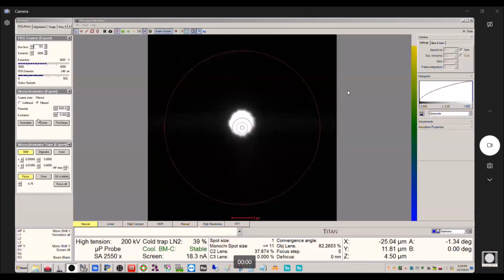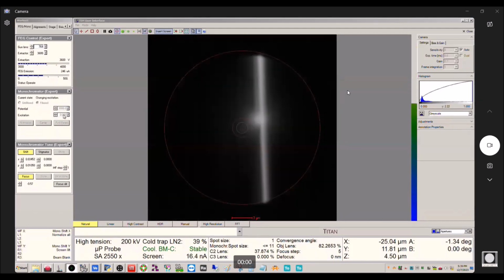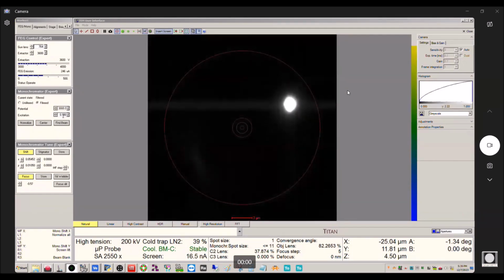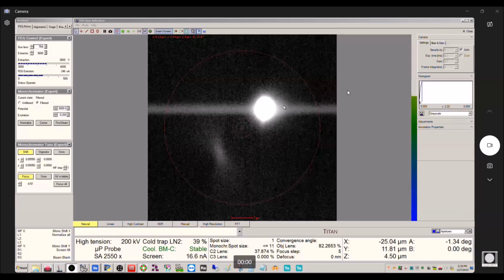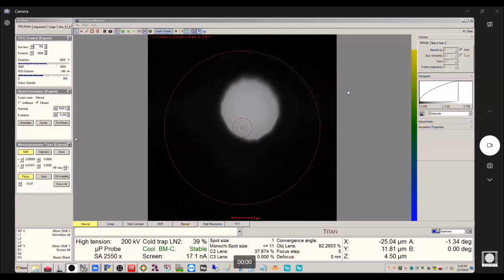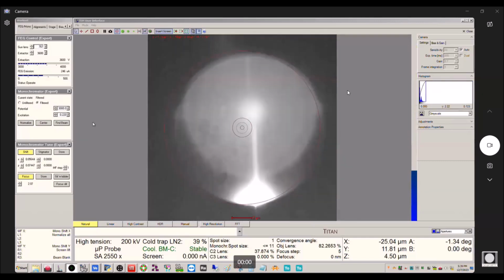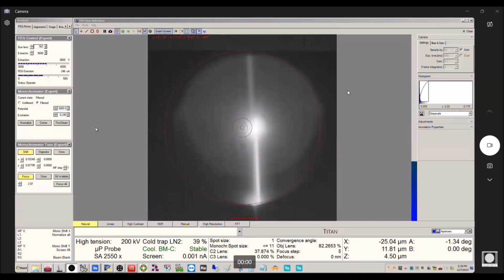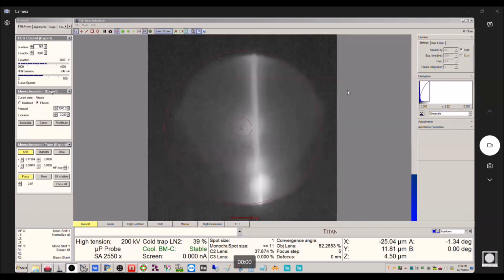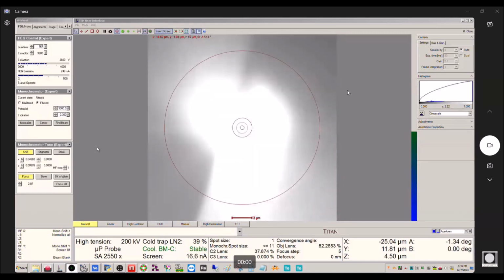okay? So you can see now in this panel, right, it switched this to filtered, and now it's ramping this up. And as the excitation increases, what's happening, as you can see, is the beam is shifting. So it's automatically shifting the beam back as the excitation is increasing, okay? And so this is automated, right, as it's doing this. So this is one of the nice things about having OptiMono. Otherwise, we could do this just through this monochromator panel right here. You just click filtered, and then you input your excitation.